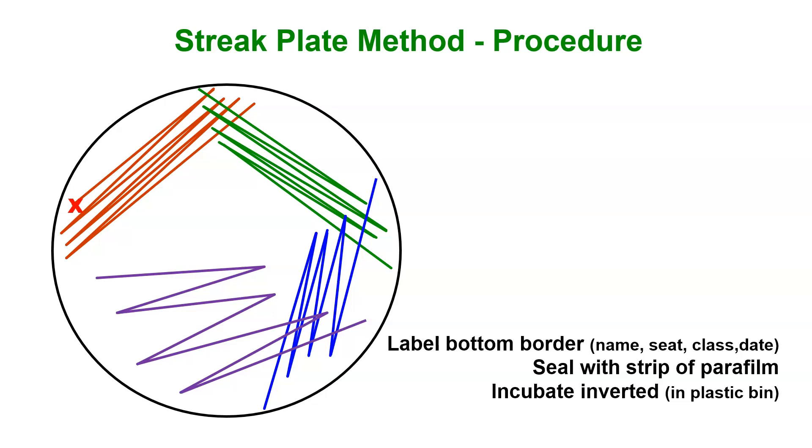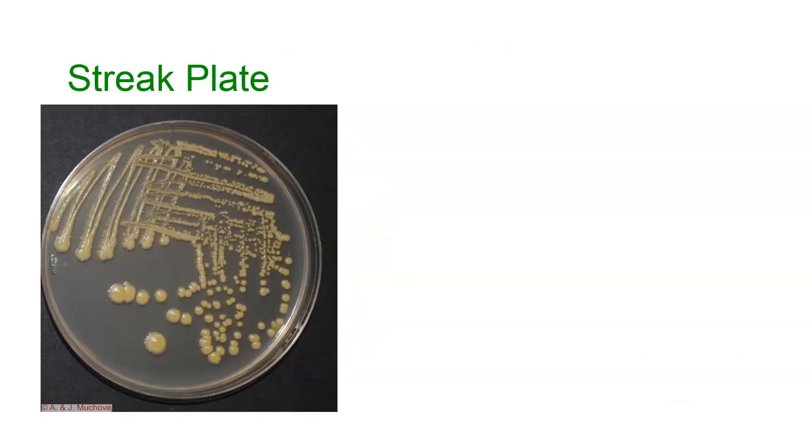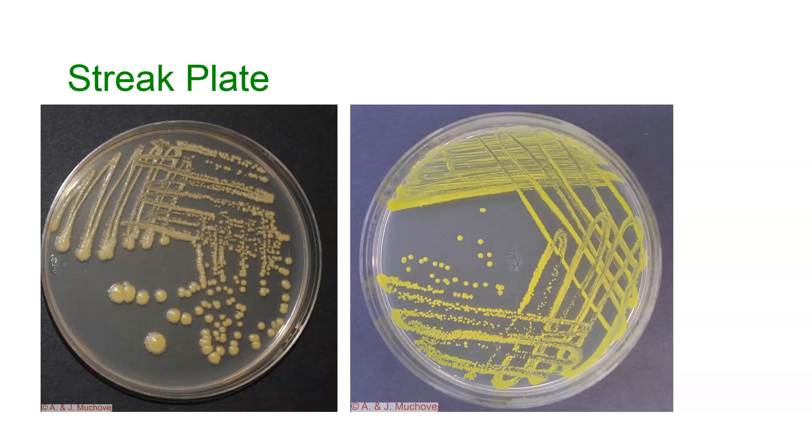And we do it inverted so that we don't get accumulation of moisture in the petri dish. If you did it right, next time you look at it, it's going to look like this. You can see very distinctive individual little colonies. You've got some colonies that are so separated away that you can easily take that particular colony out, or a little bit of it, and then you will have basically what we call a pure culture.